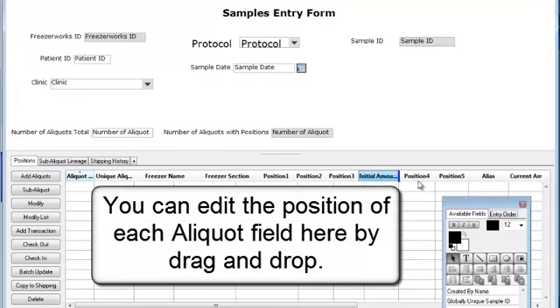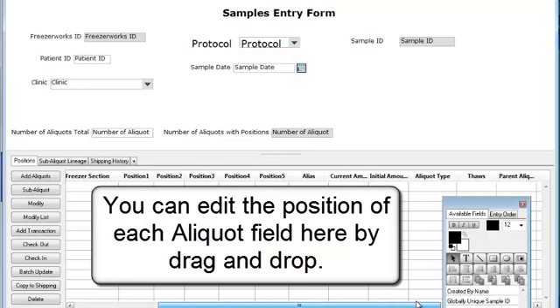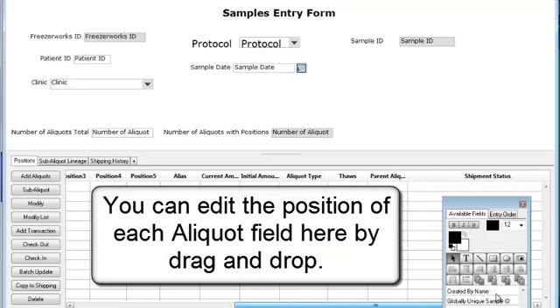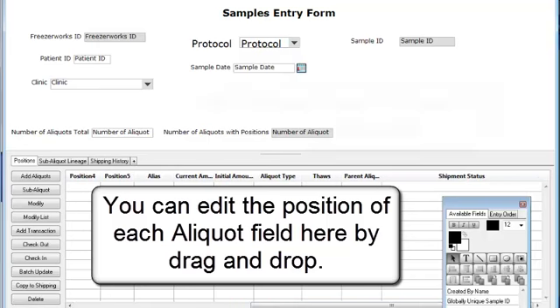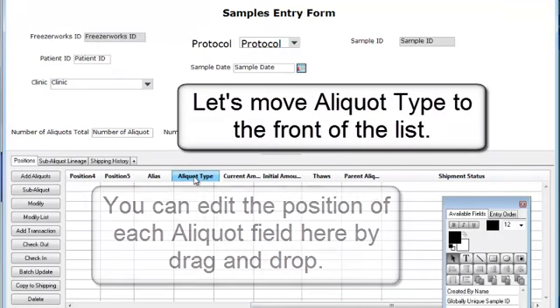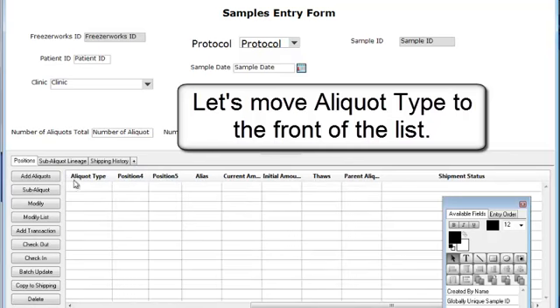You can edit the position of each aliquot field here by drag and drop. Let's move aliquot type to the front of the list.